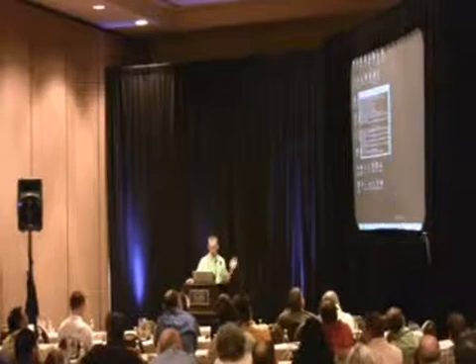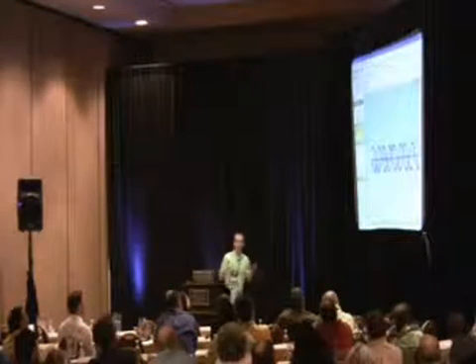So I'm going to stop there, and I just want to show you now what these researchers... To design these motifs, researchers sat down with pencil and paper, basically on a napkin, or they created a little plastic model of this stuff, which is very tedious, and spent literally months designing that structure and getting it to a point where they felt like they would have a successful experiment if they bought the material, synthesized the DNA, and mixed everything together.